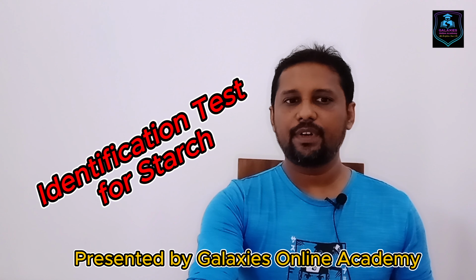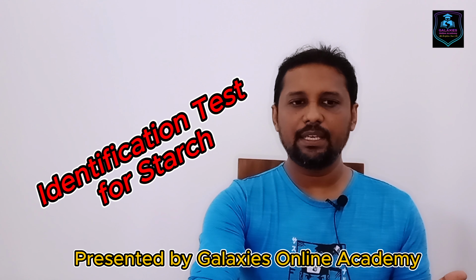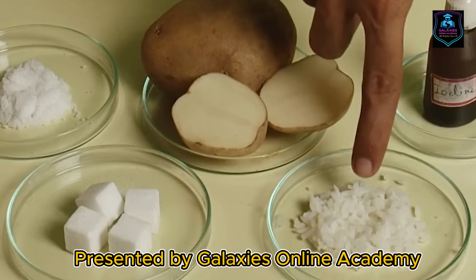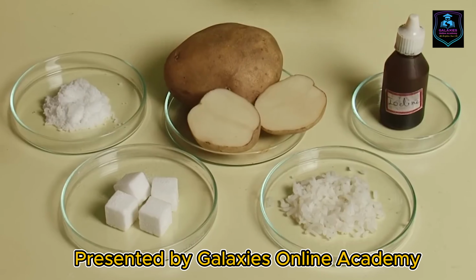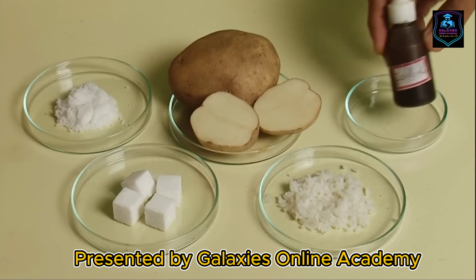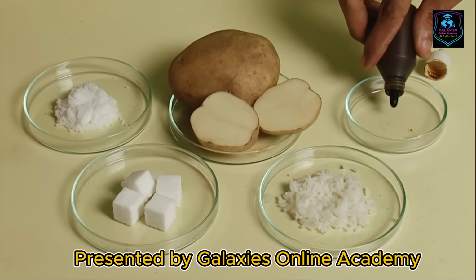To identify the starch, I got some food materials. Now you can see what food materials I got: potato, rice, sugar cubes and salt. Then we also have to use iodine solution to identify starch. Now look at the color of the iodine solution. It is yellowish brown.